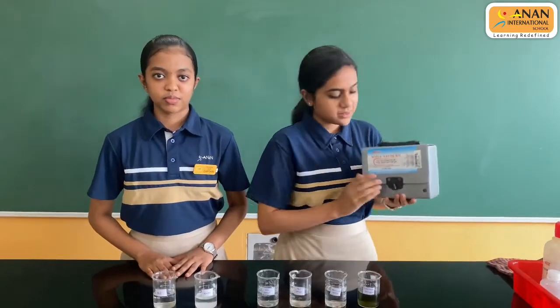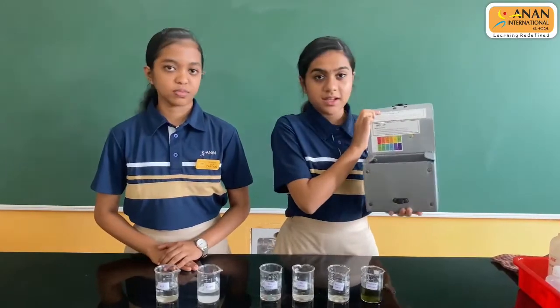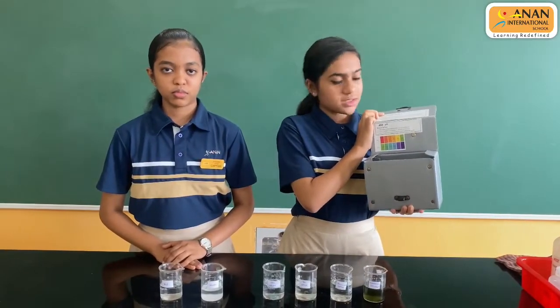This is the pH testing kit. This is the pH scale, and it comes with different colours to check the different pH values.